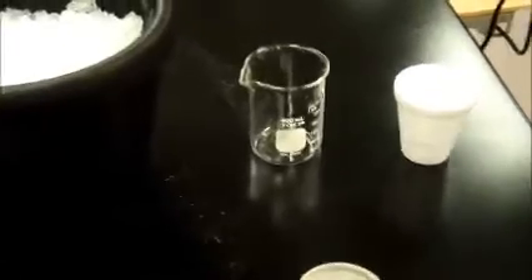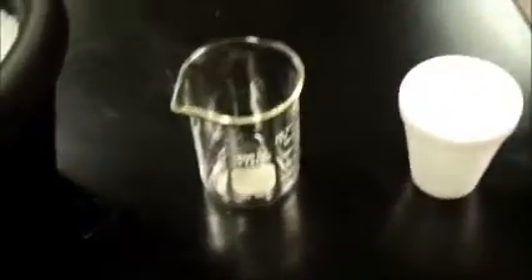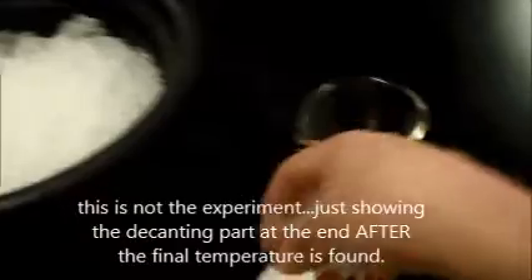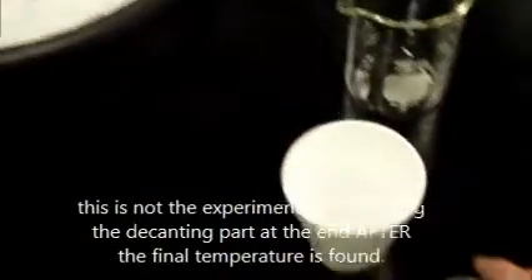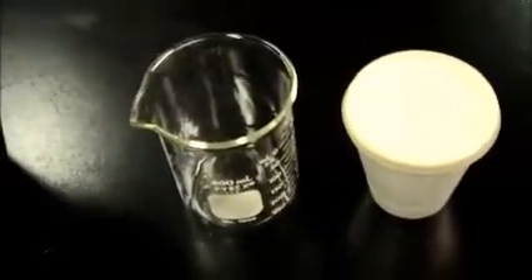This video is to demonstrate the proper way to decant. In this experiment we needed to add some ice. Now I'll put some ice in here. And you'll perform your experiment. And you'll need to remove — separate the water from the ice.